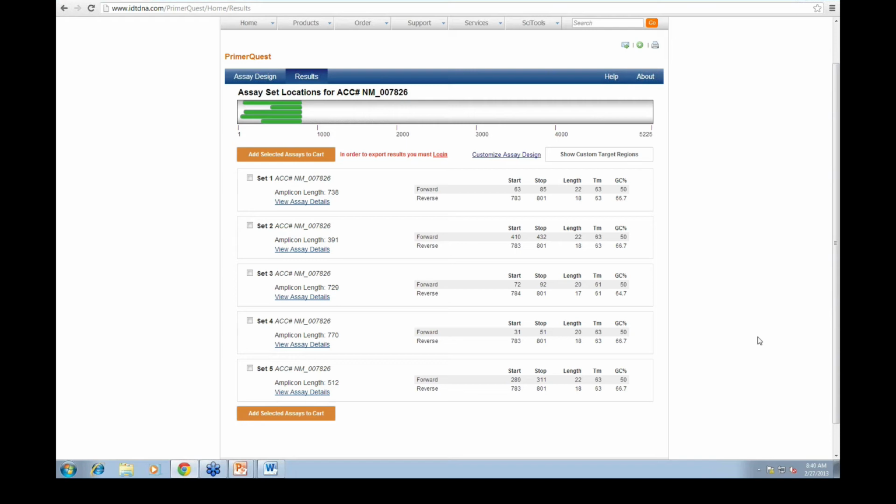Okay. Absolutely. So let's see here. Let's move on to another question here. Let's see one more question. So how can we know if there are more SNPs in the amplicon and how to exclude them from the amplification sequence? And when I read this question, I was actually kind of thinking about maybe mentioning the assay libraries that we have.